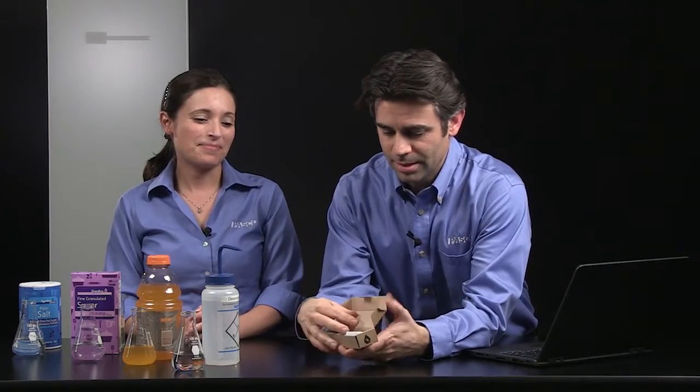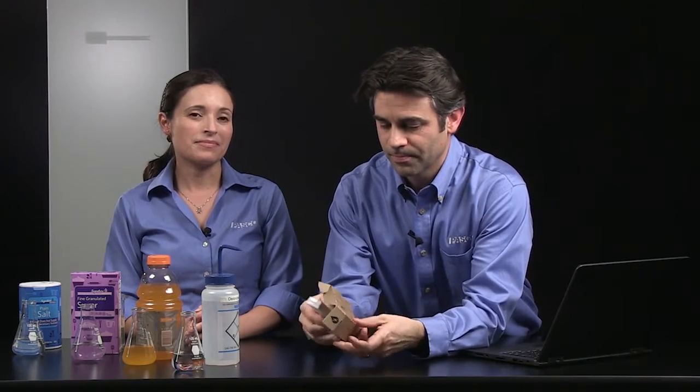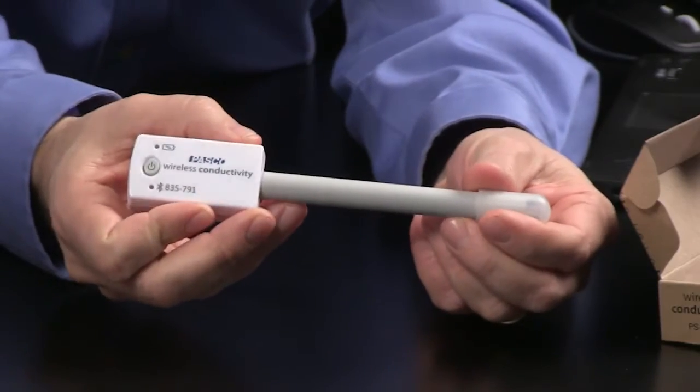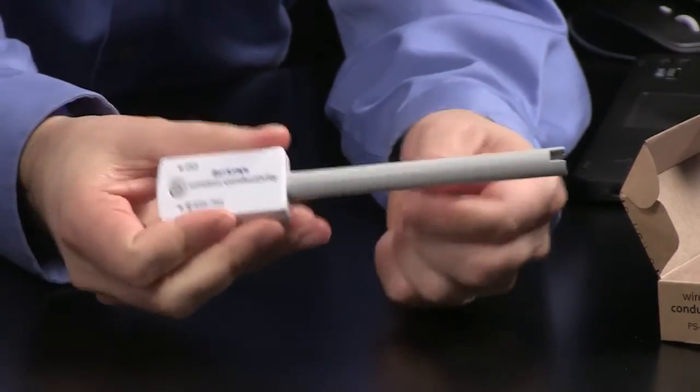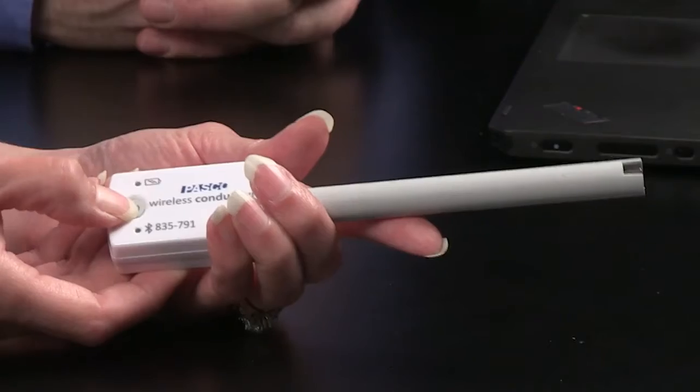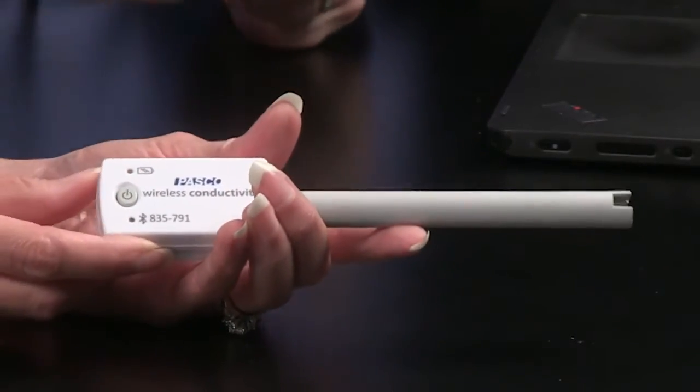Right out of the box, this sensor is ready to use. There are no additional wires or cables to get in the way of your students doing experiments. All you have to do is take off the little sensor protector and it is ready to go. This does come with a coin cell battery and it should last for about a year of typical use. If that red light stays on, then you know it's time to change the battery.